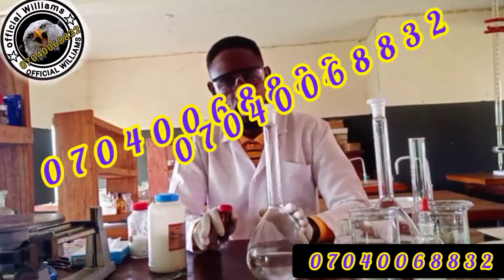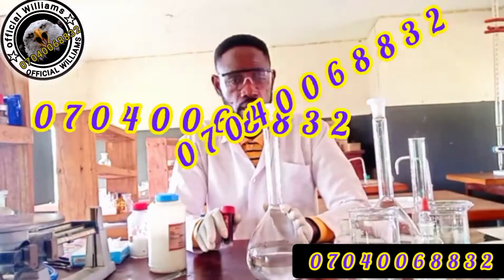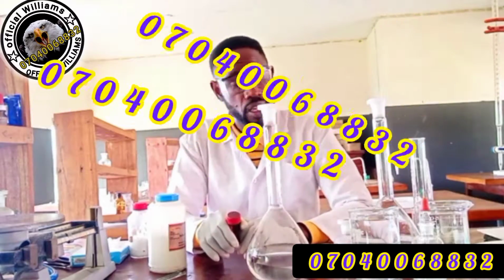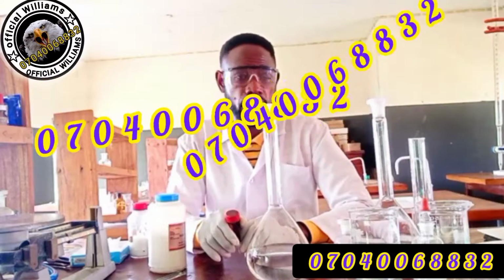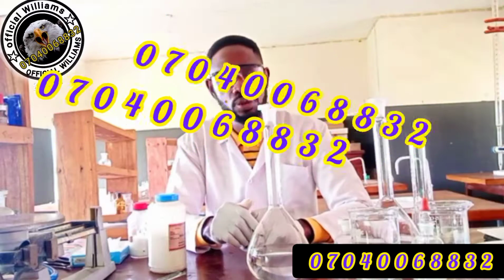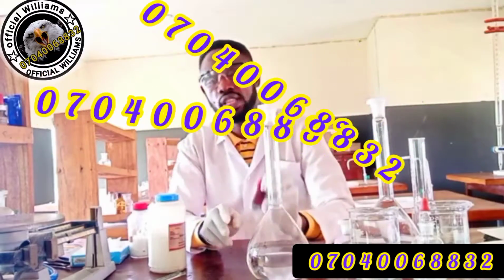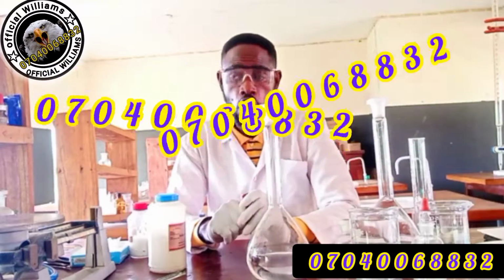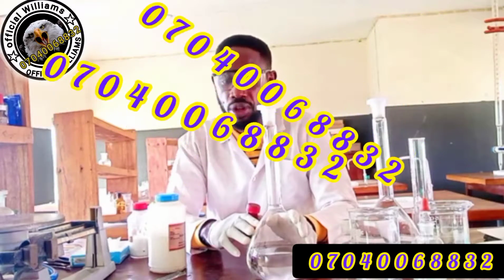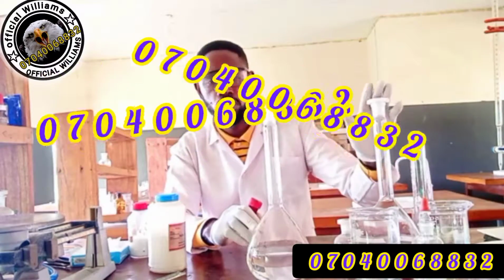From my analysis, from my experiment, is it possible for 6 grams of potassium iodide to dissolve 25.4 grams of iodine crystal completely? No, it cannot. And what must you do? You stir, and remember, this particular iodine is volatile, it sublimes. It is too unstable to the environment. So follow the instructions, don't correct them. Then, because of the instability of this iodine, I advise chemistry teachers to prepare this solution for their students very early in the morning on the day of the exam, not a day before. For this particular solution A, you can do B anytime you want.